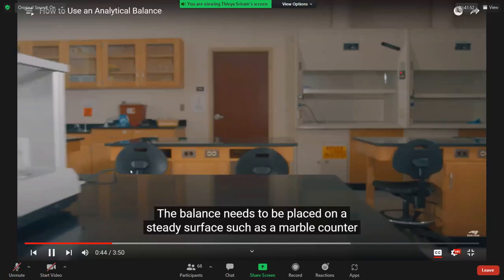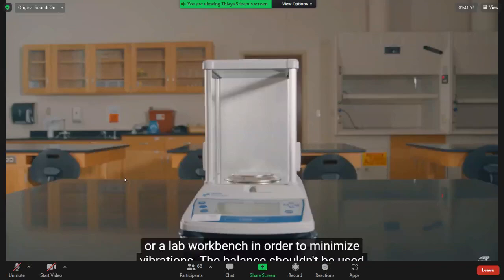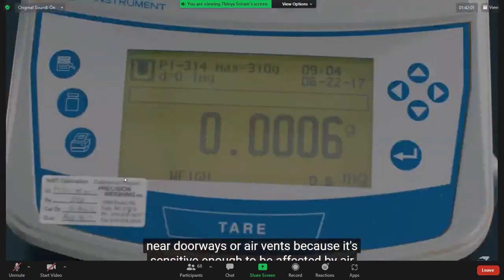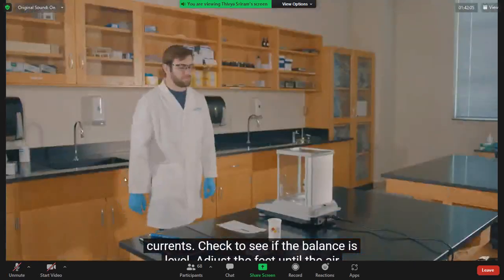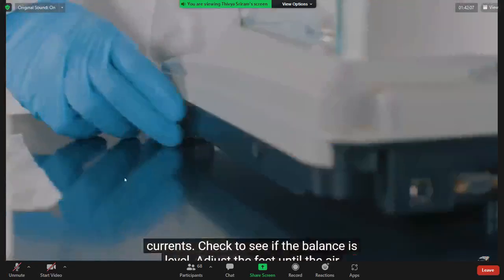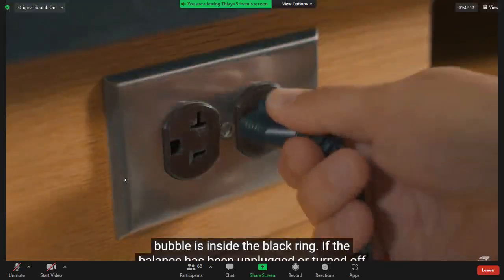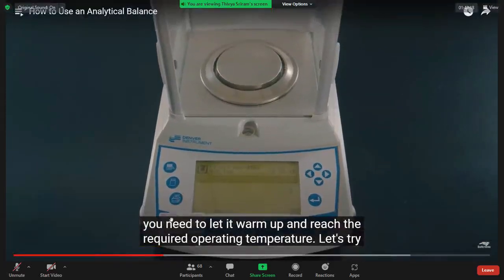The balance needs to be placed on a steady surface such as a marble counter or a lab workbench in order to minimize vibrations. The balance shouldn't be used near doorways or air vents because it's sensitive enough to be affected by air currents. Check to see if the balance is level. Adjust the feet until the air bubble is inside the black ring. If the balance has been unplugged or turned off, you need to let it warm up and reach the required operating temperature.